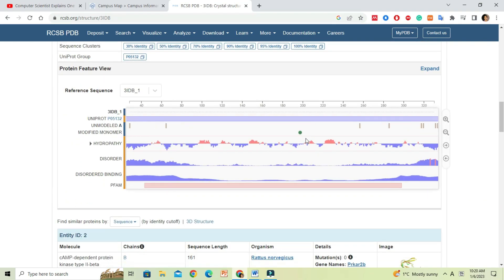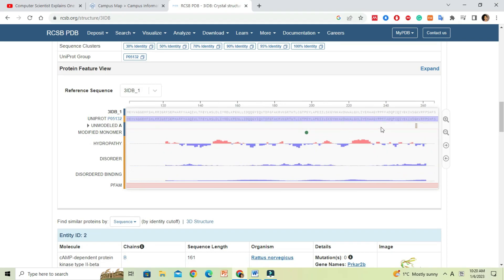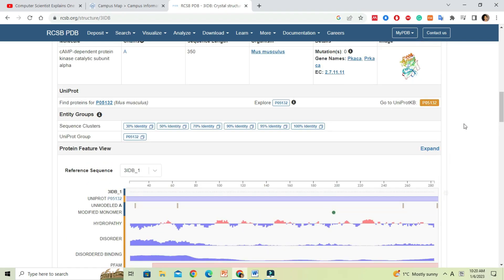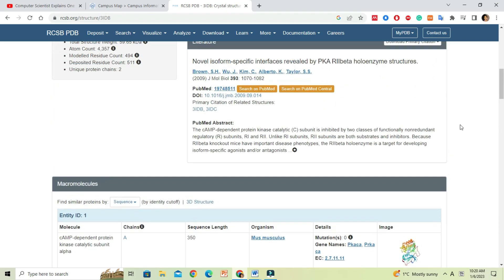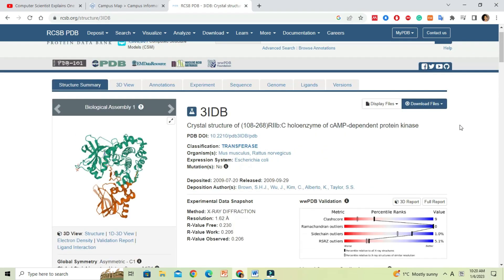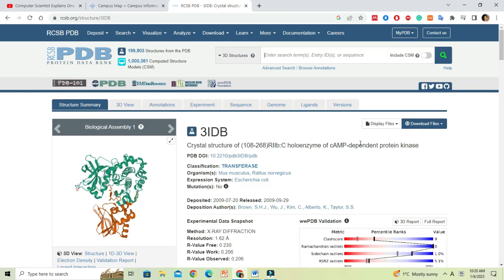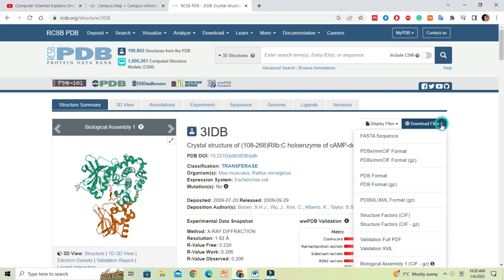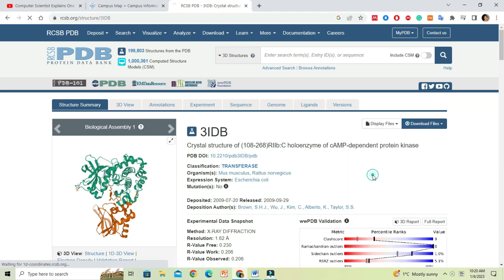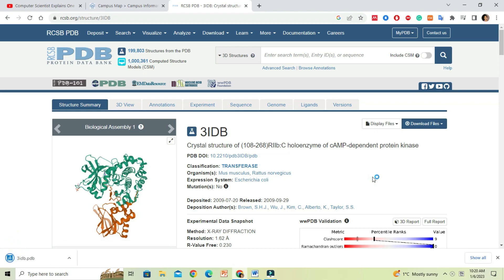This page contains a lot of data related to the structure we searched. Now, if you want to download the structure file, go to download file icon at the top right corner and select PDB. Once you click on the link, the PDB structure will be downloaded into the download folder.